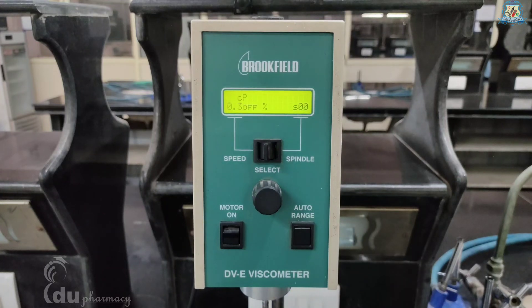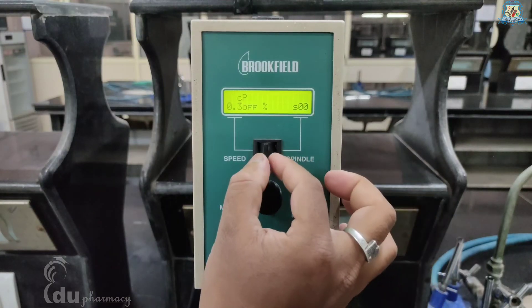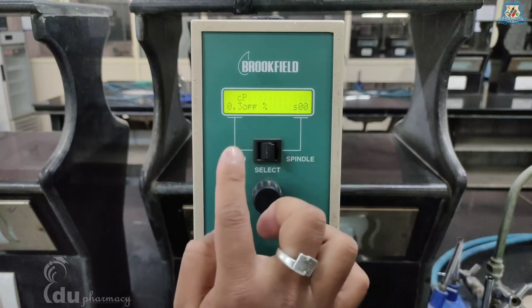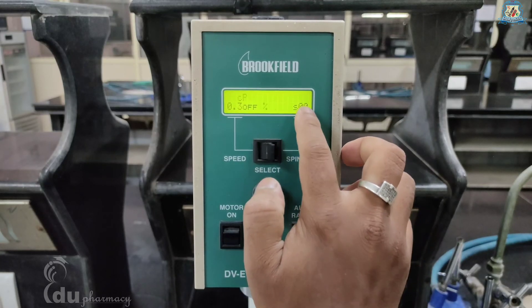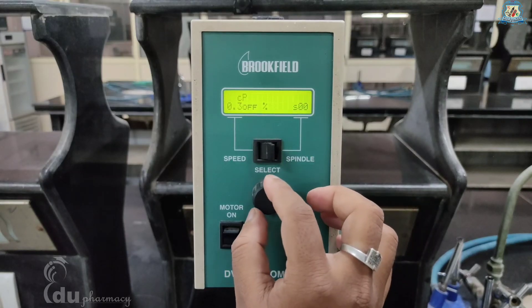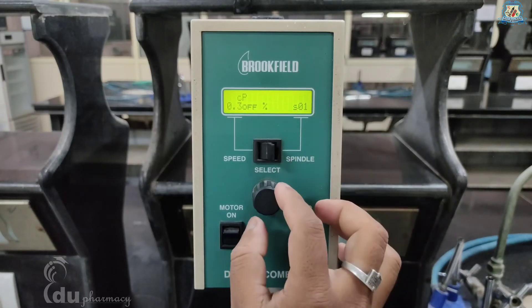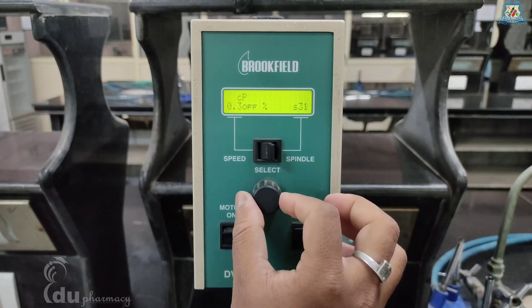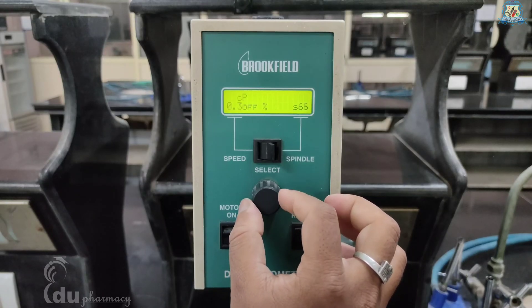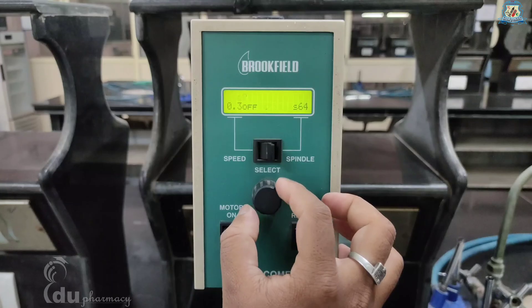Let's move towards setting the parameters. First you must set the spindle number. Shifting the speed/spindle switch to the right position will allow you to adjust the spindle selection using the select knob; rotate it until the desired spindle number is selected. Here we have attached spindle number 63, so it must be set to 63.